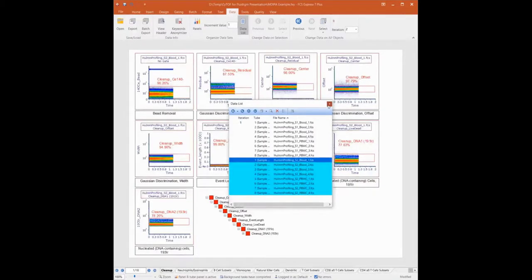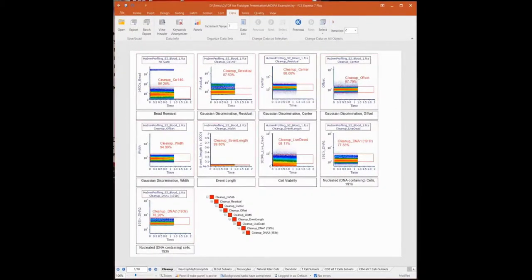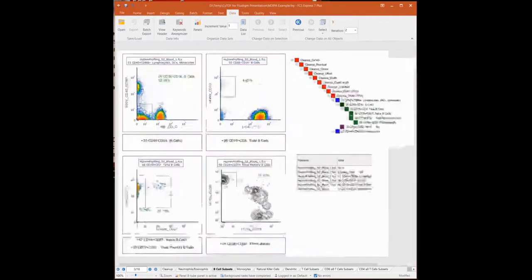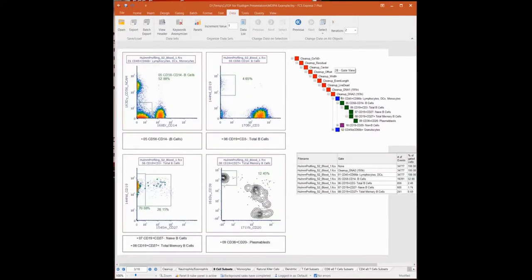Okay, so I'm going to use this analysis layout to show some examples of different things you can do. Again, in this very brief presentation, there's not a lot of time to get into detail, but I do want to point out that there are a lot of gates. This layout has tons and tons of gates available to it. You can see here, as an example, all the gates are already pre-made and placed in a default position for you, generally where they're supposed to go.